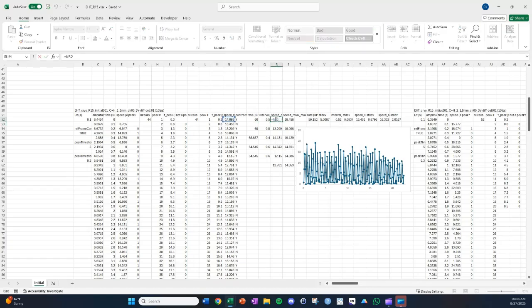And this just gives the speed. If there's a y next to this, then you would want this cell to be highlighted here because it's contraction speed, and then relaxation speed. If there's an n next to this, you'd want the cell to be highlighted here because this column should be relaxation speed. So I'll drag these down. Make sure you leave this space when dragging it down.